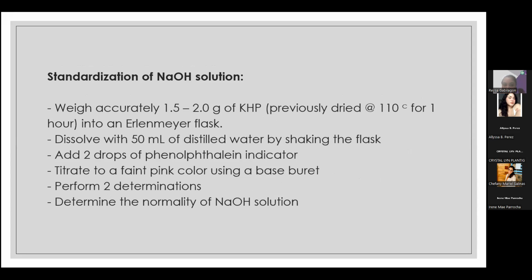That is, again, the primary standard. So, nag-weigh kayo nito, and pag nagamit ka kasi ng primary standard, supposedly, di ba, our sample is the sodium hydroxide, but in the case of using primary standard, the primary standard will act as like an analyte. It will be the one to be placed in the Erlenmeyer flask and added with phenolphthalein.